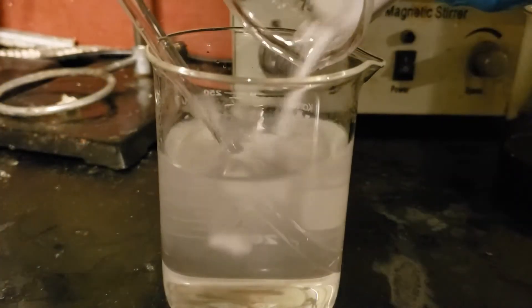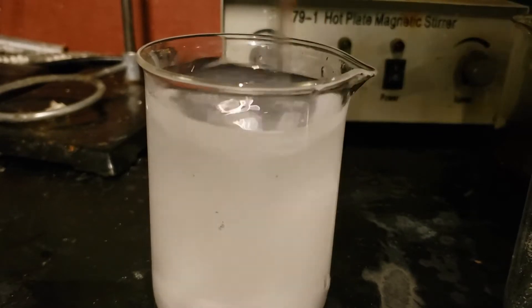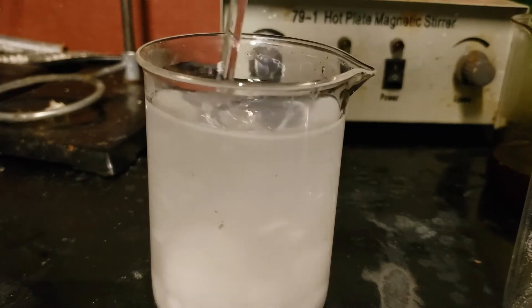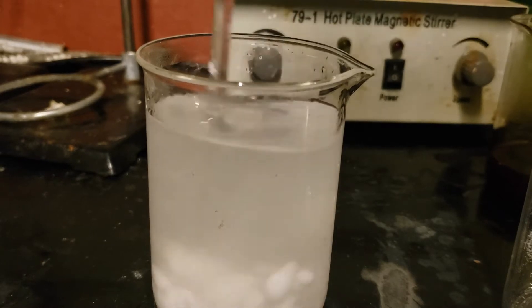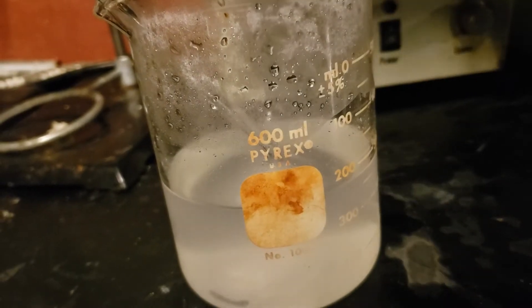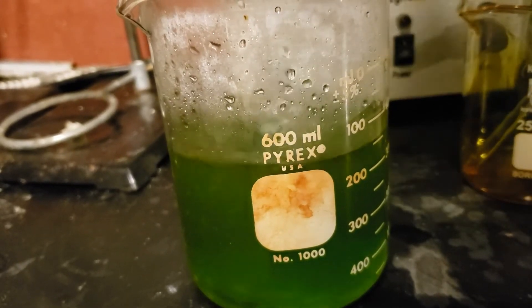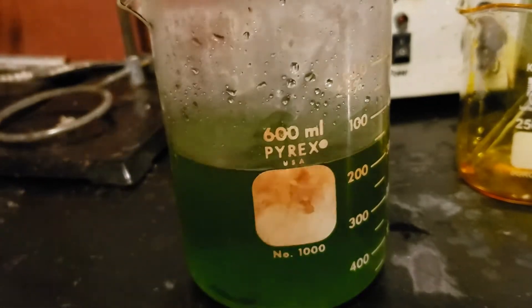To the potassium hydroxide solution, 48.22 grams of oxalic acid dihydrate is added with stirring. A microwave is needed to help dissolve everything. Once everything is dissolved, the ferric chloride is added and the beaker is rinsed with a little water. This forms a green solution of potassium ferrioxalate almost immediately. Not all of the oxalic acid added earlier dissolved, but this ended up being okay because there was none in the final product.